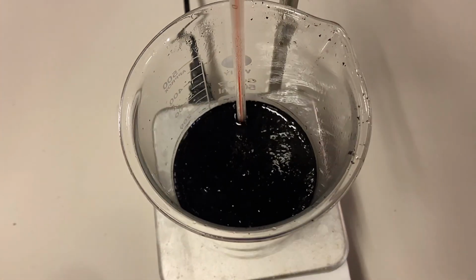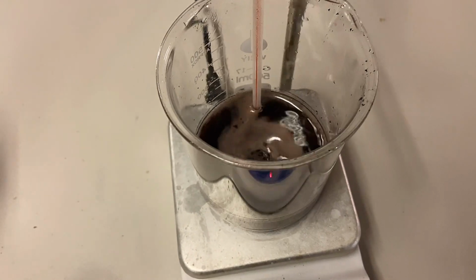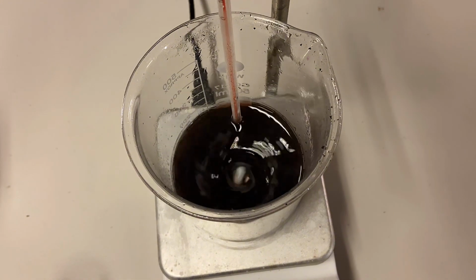As you can see, if I turn the stirring on a bit, not all of it's dissolved. Some of it is dissolved. It's kind of hard to see on camera, but there's a very deep red hue to the liquid, which means that there's a lot of cobalt in there.